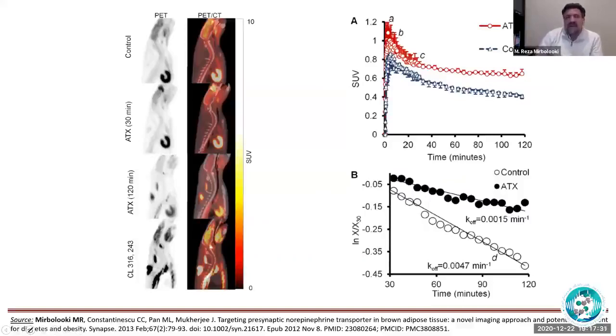If a rat is not fasted, then there will be lots of insulin available in the blood because it's postprandial, and that insulin may push glucose to go to the other tissues. By that, F18-FDG goes down, and because the amount of F18-FDG is limited, any organ that can absorb more of that glucose, perhaps because they have more glucose transporters, is going to get more of the uptake and the others will not.